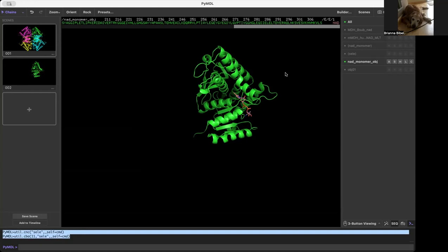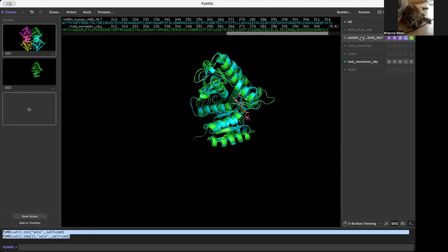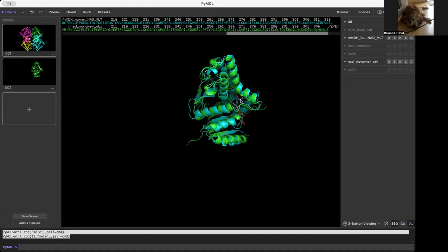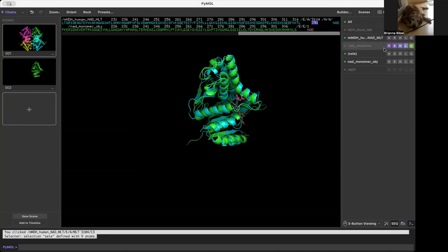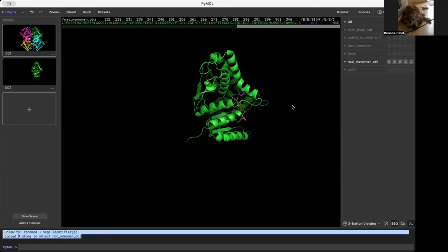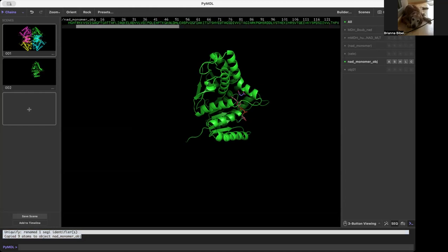Just like you can copy to a new object, you can also copy to an existing object. Say I have the structure of malate dehydrogenase bound to malate and I want to copy this molecule of malate into my other object. I can select that malate, then go to Action, Copy to Object, and copy to this NAD monomer object. Now you can see that my NAD monomer object has both the malate and the NAD in it as well as the chain.